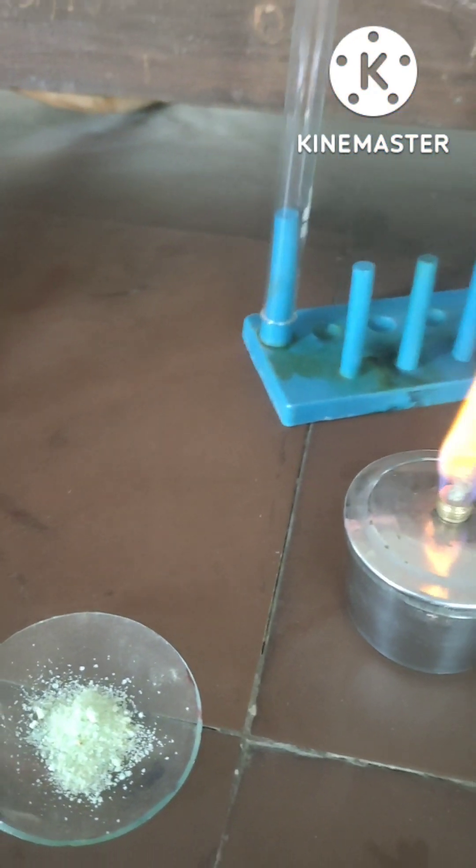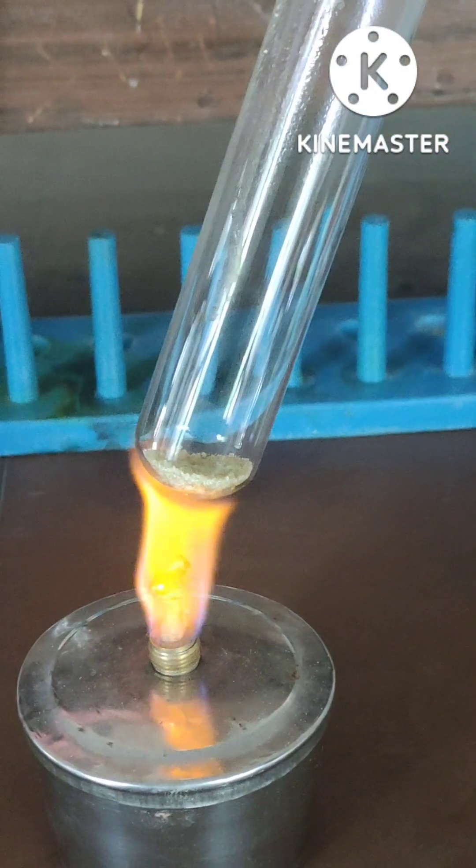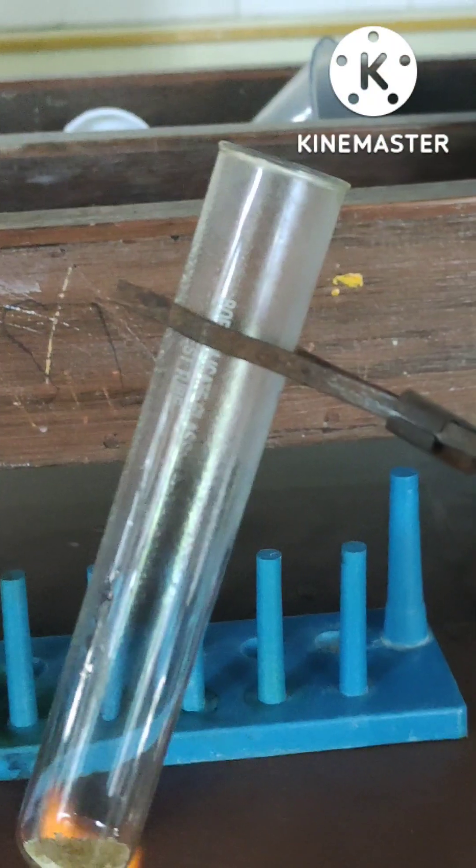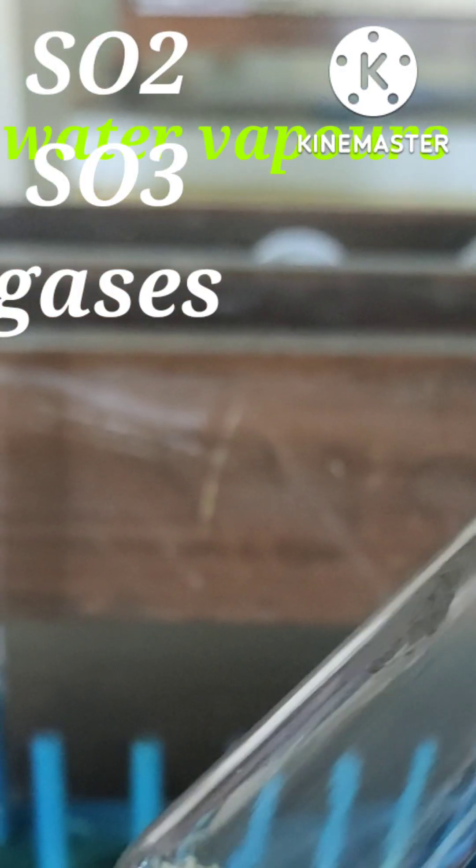Let's take a dry test tube, put the ferrous sulfate in the test tube, and heat it gently. We'll find that two gases come out: sulfur dioxide and sulfur trioxide.